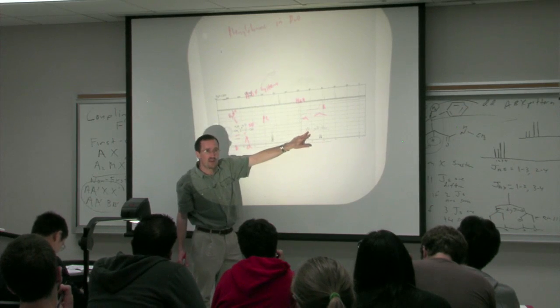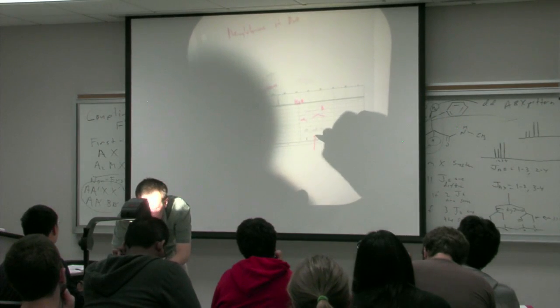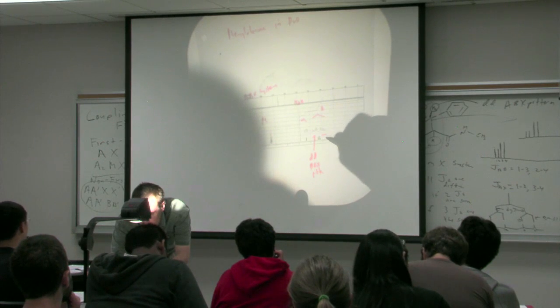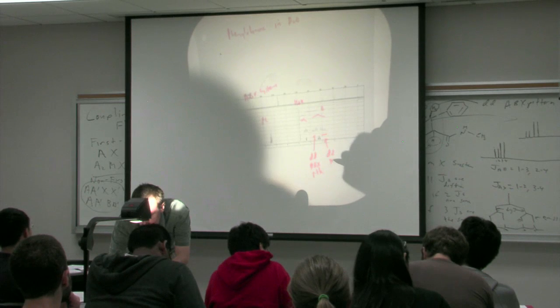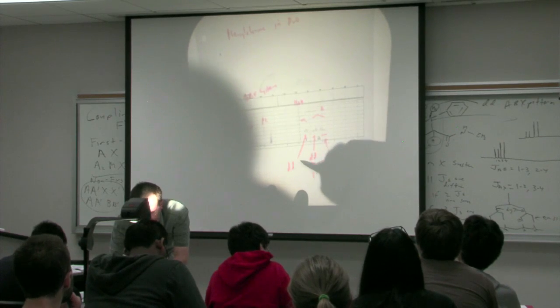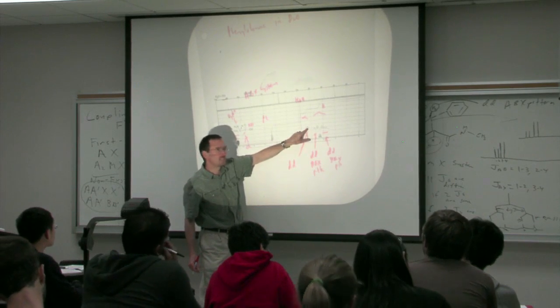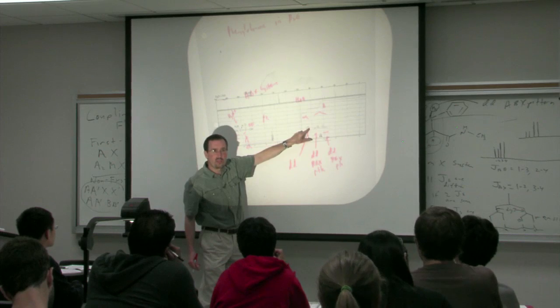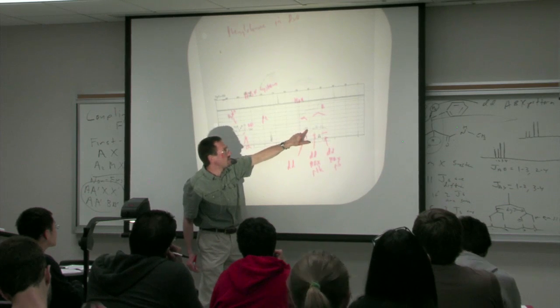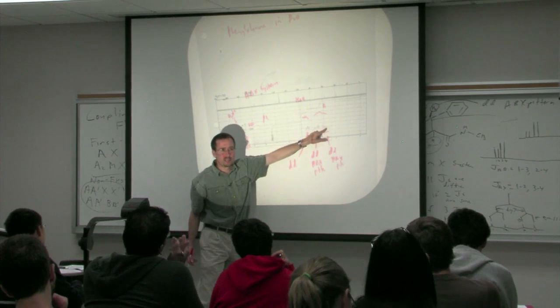And so you'll notice now the alpha proton is split into a doublet of doublets. So each of these is a DD ABX pattern. And then you'll notice that our alpha proton is a DD. And the doublet reflects the two different couplings. In other words, the distance between lines 1 and 2 or 3 and 4 corresponds to the 6 hertz coupling. And the distance between lines 1 and 3 and 2 and 4 corresponds to the 8 hertz coupling.